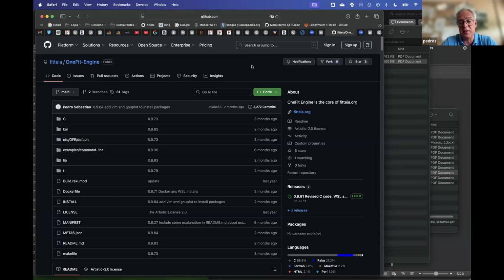Actually, there is no big difference in fitting NMRD profiles or any other data. It's just the choice of functions and the particular defaults in your plots, in your graphical presentation, because different types of data require different ranges and different settings to show the data clearly. And that depends on the problem. But once you have an interface to deal with the fitting engine, you will be able to fit or deal with any type of data. So there is no big difference.